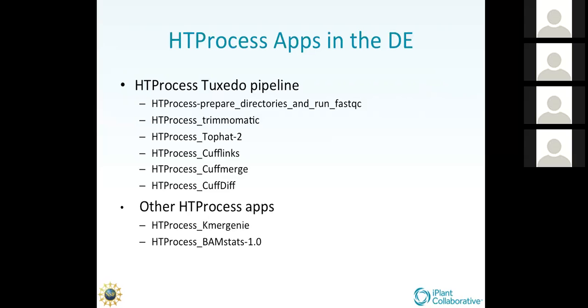The information is assessed in the beginning, it's stored as much as possible, and then the information is used in the downstream applications for doing data analysis.